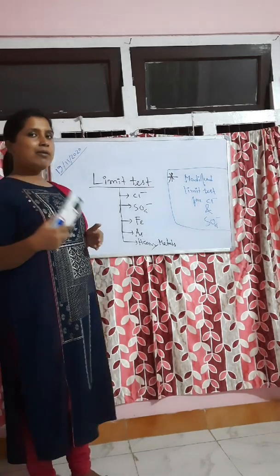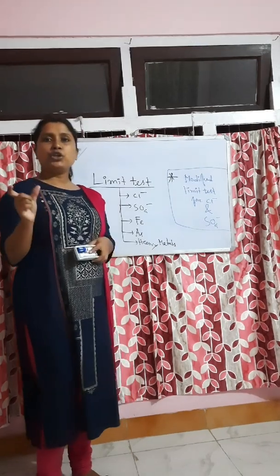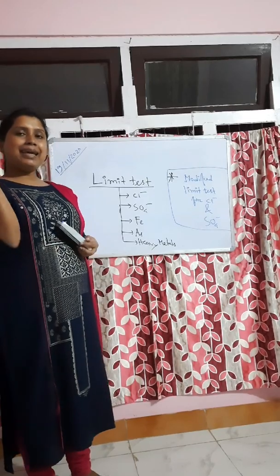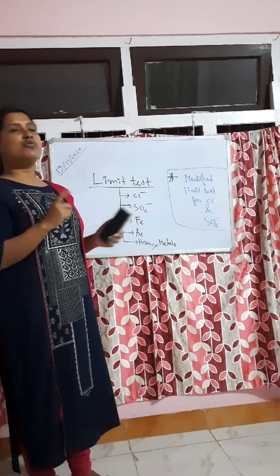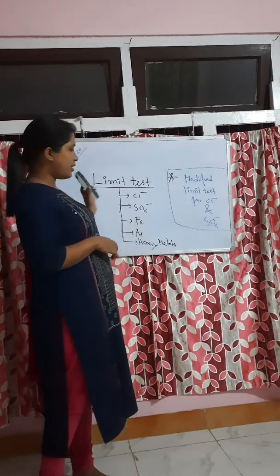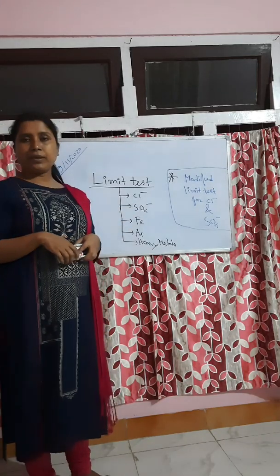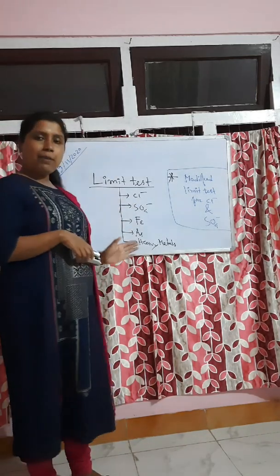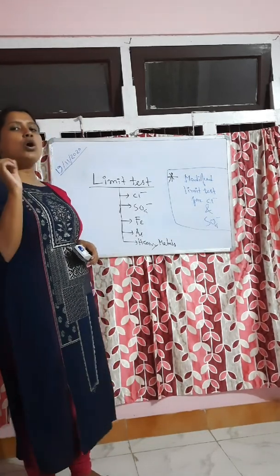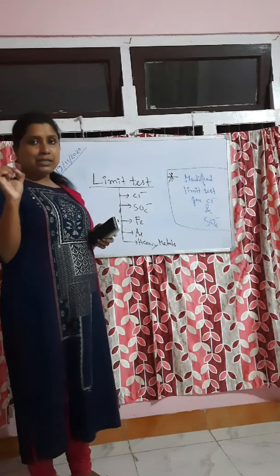I have provided the principle and procedures for all these limit tests. In the exam, certainly you will get a question from this section, mainly from chloride, sulfate and arsenic. There is a maximum chance of getting a question from these. You may get questions from all, but you will positively get a question asking you to write down the principle or procedure of that limit test.